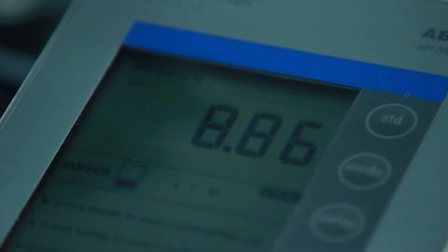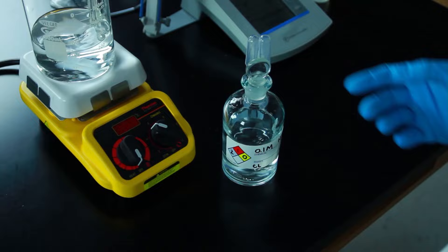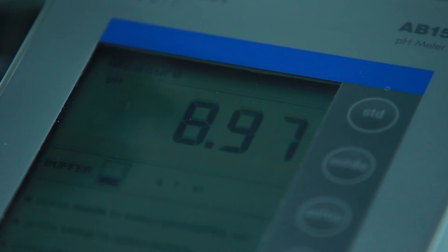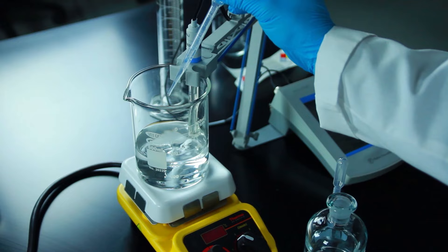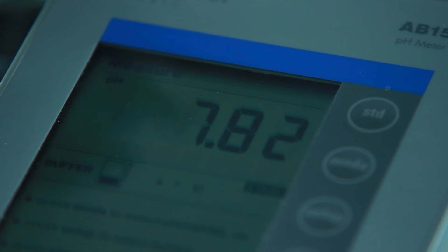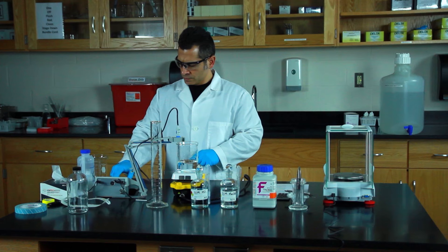We need to add hydrochloric acid to lower the pH to 7.8. Add a couple of drops into the beaker. Wait for the pH to stabilize. Now add a few more drops of hydrochloric acid until you reach the target pH of 7.8.